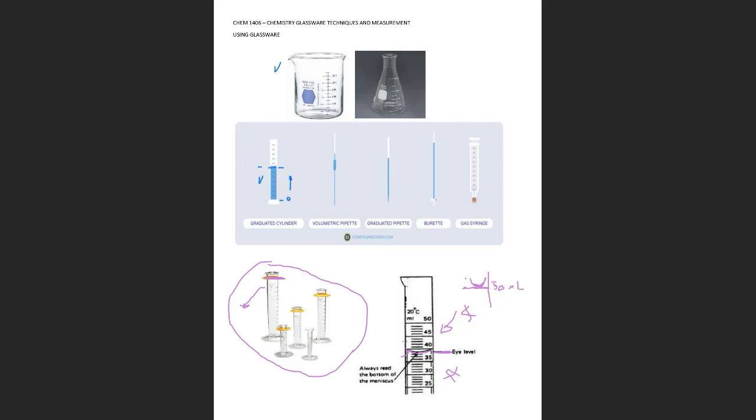That's all it is. So if you see a yellow bumper, some of the cylinders come with that yellow, you keep it up or toward the top, basically to protect in case it falls down, it won't break. So pay attention to all these little details.